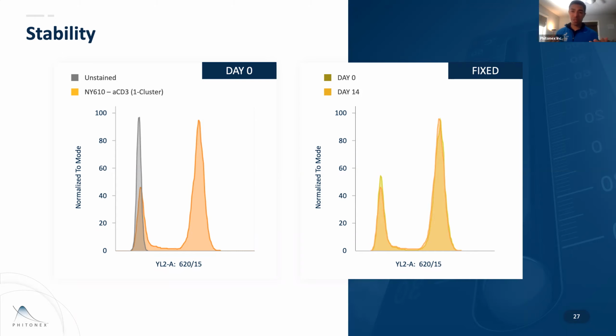And kind of an interesting and honestly somewhat incredible result, right? When we think about having limited access to laboratories, this suddenly becomes incredibly interesting. But it's also interesting from a chemistry point of view. If you think about leaving something in 1% PFA for 2 weeks, which is just the longest we've tested, that is an incredibly intense solution to be leaving fluorophores in, right? And so, I'd love to see us expand that. I'd love to see us put out the challenge of, put it in this pretty aggressive solution. Let's see how fluorophores stack up. And I think I'd love to see us get to that soon.